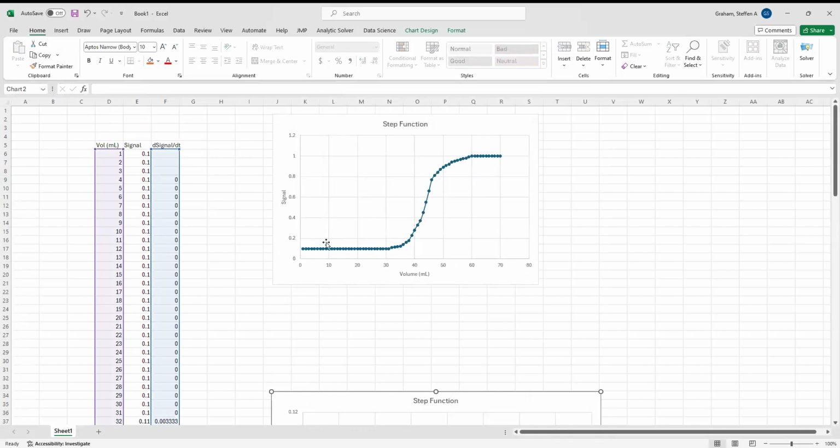Maybe let's say this is at the end of your run and you have your elution buffer with some low level of salt, and then you're doing a strip, a 2 molar. I don't know if you'd actually want to do it where you potentially have other species eluting. So maybe we say this is at the beginning of your run. You're going from some low salt buffer into a higher salt buffer. And that's your phase transition.